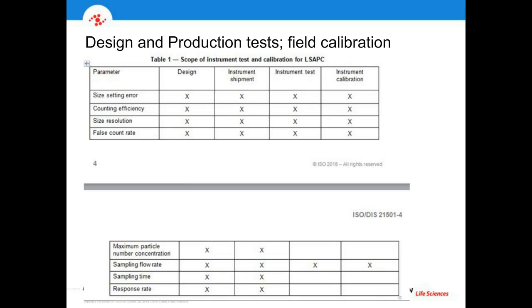and that statement of calibration, the test or the calibration over the lifetime, involves fewer tests done in that time period, what we would call generally the calibration time period, versus when, for example, a unit is first designed. It's much more exhaustively tested, as well as in the initial production use of it. But over the lifetime of the instrument, just a few of these tests are needed to verify that it is continuing to operate as designed.